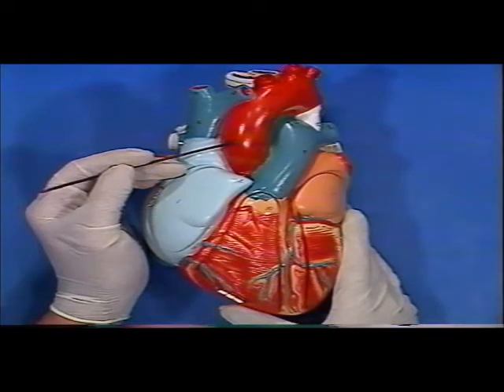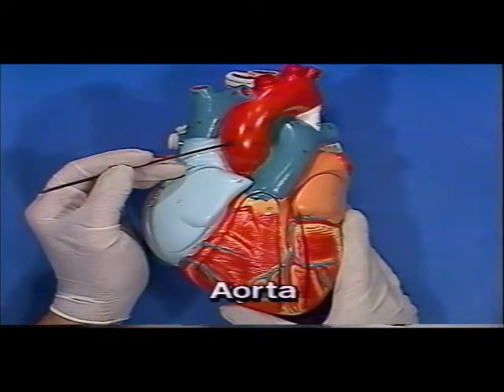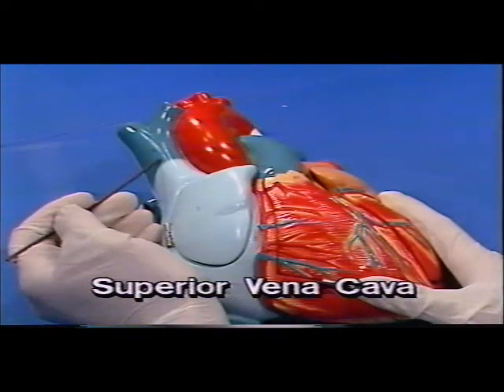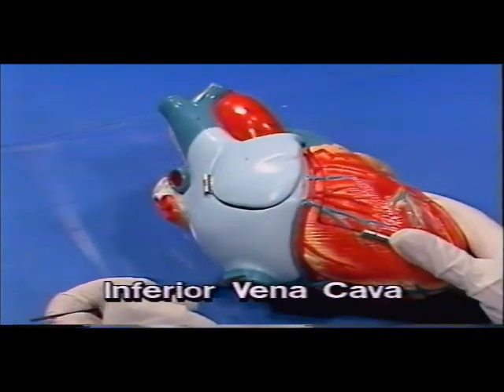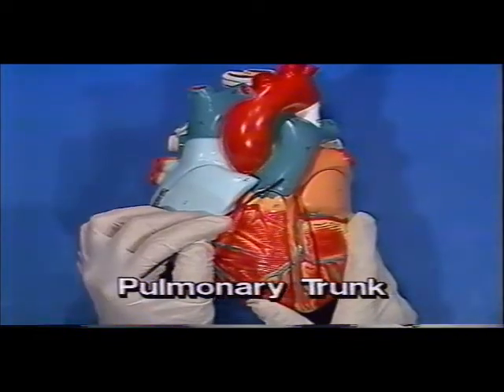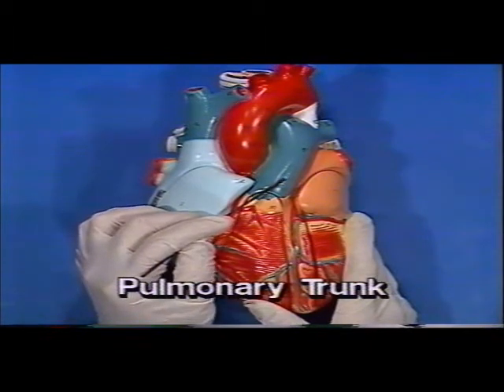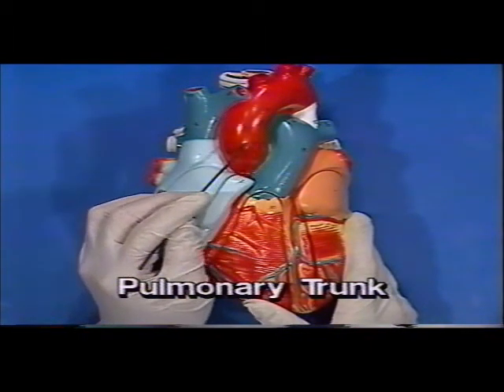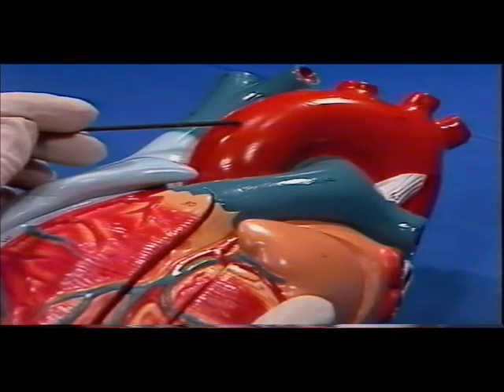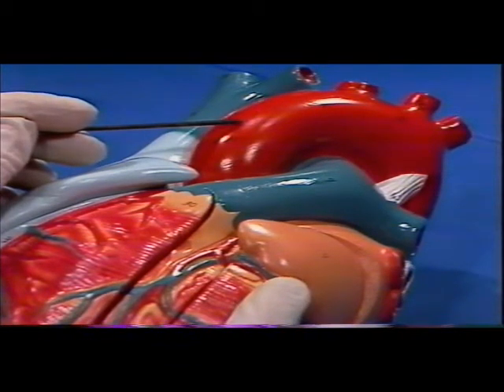For further orientation, turn to a model of the human heart and note the position of the great vessels at this time. These include the largest artery of the body, the aorta, the superior vena cava, and the inferior vena cava, the largest veins, and the pulmonary trunk, which carries blood to the lungs to be oxygenated. Note again the position of the aorta as it arches from the left side of the heart, remembering that the specimen's left is on the right side of your screen.